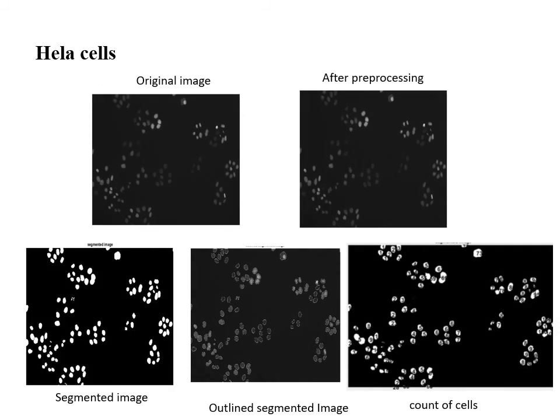This is the image through the whole project, where we take the original image, pre-process it, apply segmentation techniques, and then outline it so we can count the cells easily.